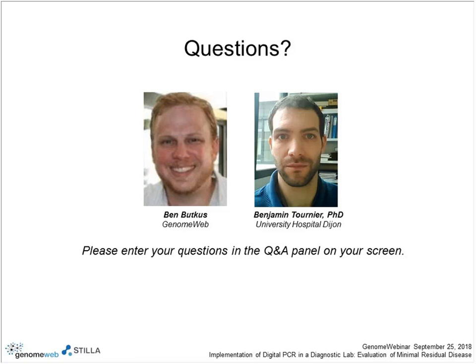In fact, it's rather rare to have a case of saturating the system with a lot of DNA. Most of the time we are in the case where we do not have enough DNA, so it's not a limiting criterion. Thank you. The next question.